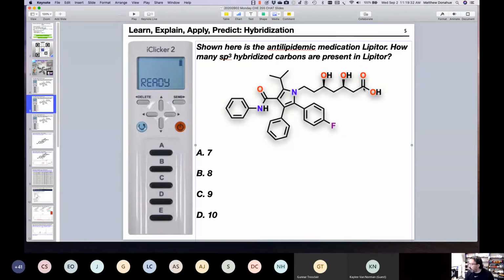So this carbon right here goes to a certain peak. It's different from this carbon, right? This is sp3 hybridized. This has 2 hydrogens. This is sp2 hybridized. It has no hydrogens. So on a spectrum, those 2 carbons should appear at different regions. So that's what we're doing. We're just learning the fundamentals of that now.